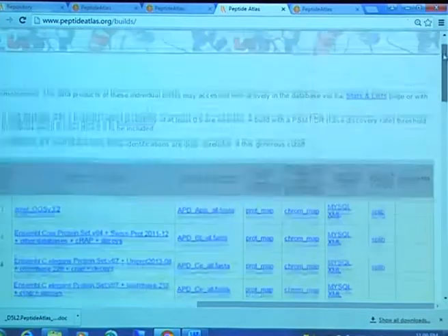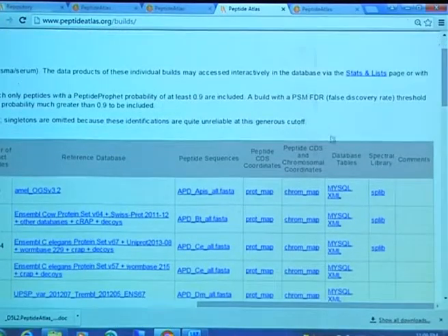And these data file types are listed over on the side. Peptide sequences as a FASTA format. Are you all familiar with FASTA file format? So it's essentially you have an accession that's delimited by an arrow bracket, the greater than symbol, followed by an accession, and then a new line, and then your sequence. Proteins are often in FASTA format, but you can also have peptides. So that's what these are. They have their peptide accession as the identifier, and then they have the sequence.